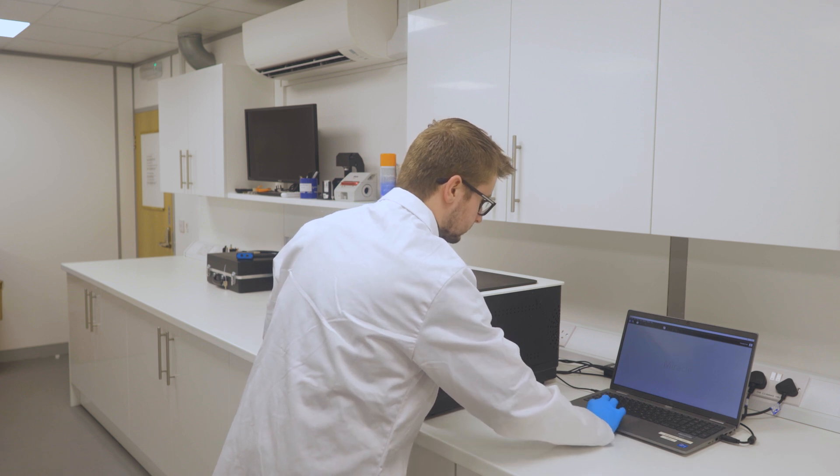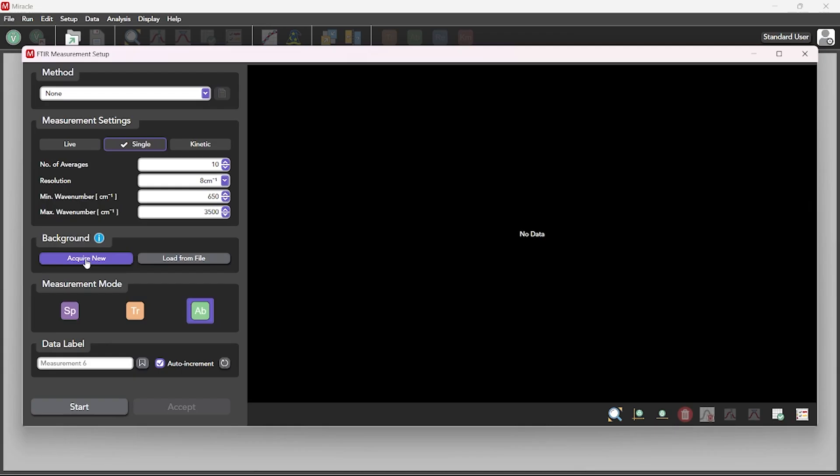Now that the sample has been placed onto the sample stage, the spectrum can be measured by pressing the start button.